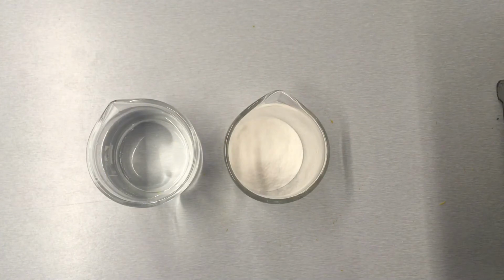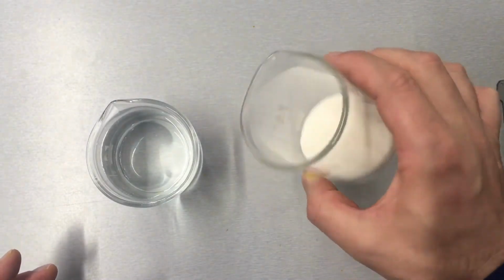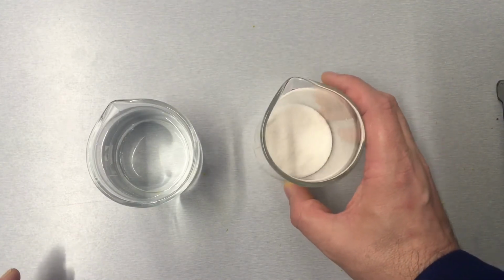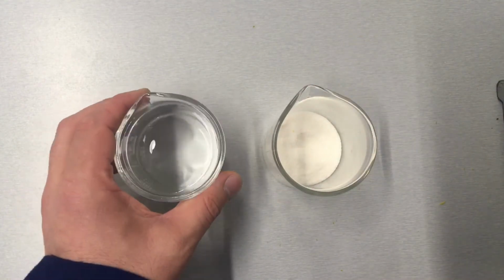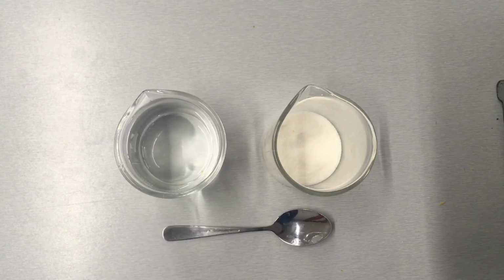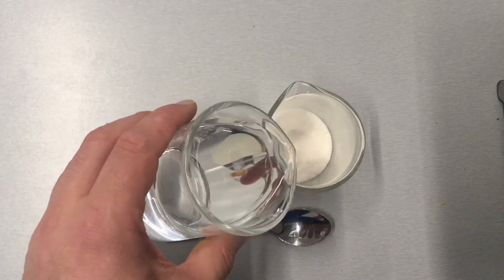Okay, so this is activity 3, and I have some methyl cellulose powder inside a beaker here. If you want to record how that looks, to my eyes, it's actually a very dry powder. It feels almost a little bit like salt in the fingers. I also have a beaker of water here and a spoon. Okay, so I've added the powder to the beaker as you see. Now what I'm going to do with this one is slightly different to the method in your book. I'm going to add the water to the powder.